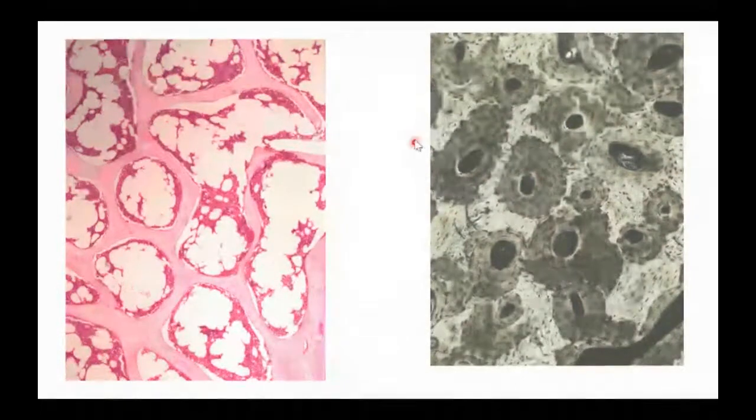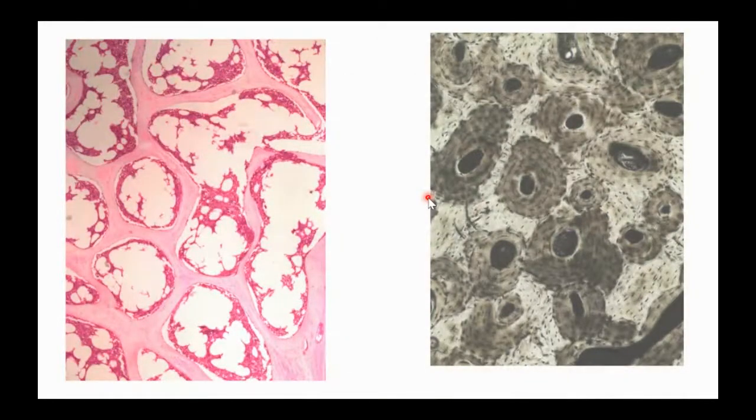That's what I see when I look at compact bone. When you look at spongy bone, like its name tells us, it kind of looks like a sponge. There's going to be some open space. So spongy bone tissue, sometimes that space looks more open. I can see a little bit of bone marrow inside here. That's the red stuff, is the bone marrow. In this case, the pink is actually the bone tissue.